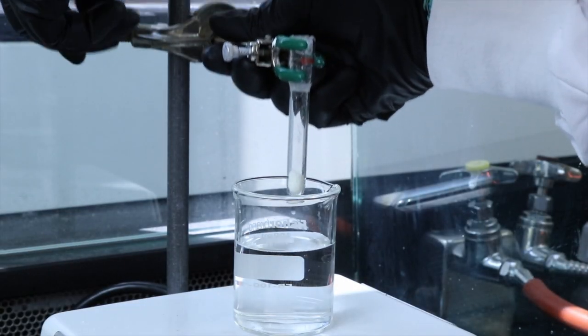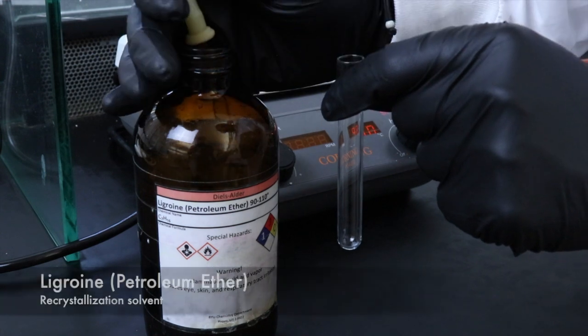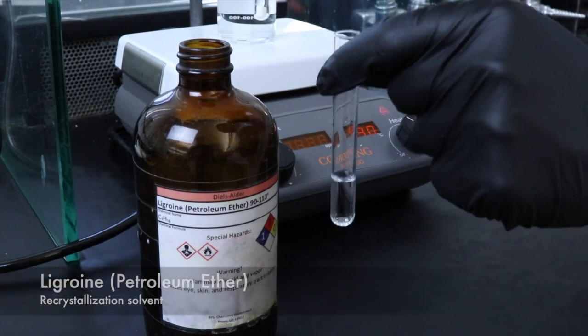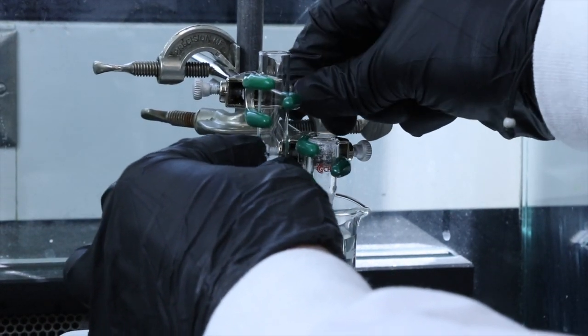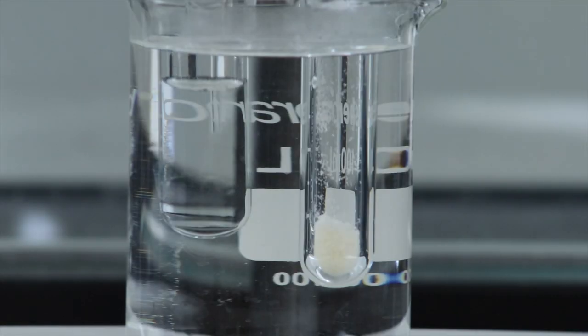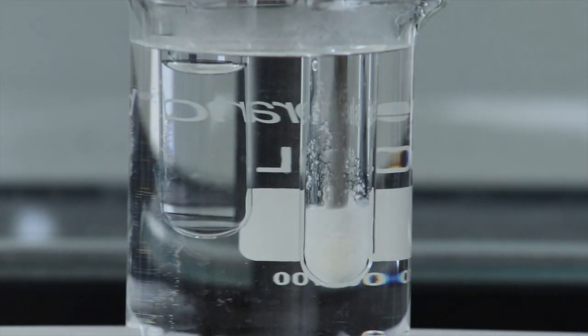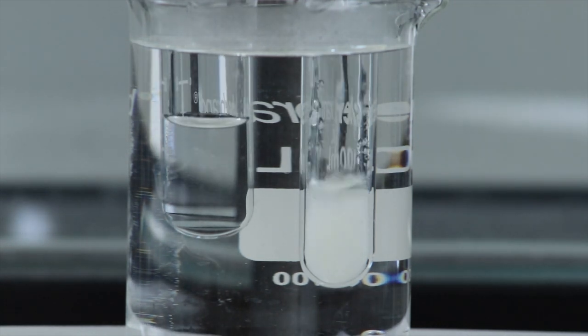I'll place it in a hot water bath so that it can be dissolved at high temperatures using ligroin as the recrystallization solvent. And I'll place that in the hot water bath as well so that it's also at a higher temperature. Now I'll start working on dissolving the alcohol product by slowly adding ligroin and stirring it, just so that I add the minimal amount of solvent to dissolve it at higher temperatures.